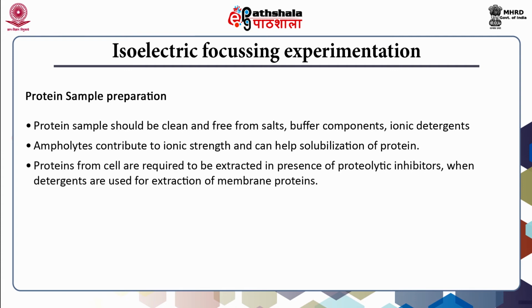Proteins from cell or tissue are required to be extracted in the presence of protease inhibitors, especially when detergents are used for extraction of membrane proteins. Purified proteins can be solubilized in water or 7 to 8 molar urea.